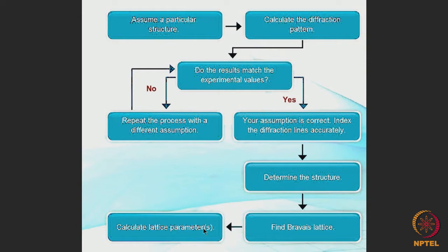If on the other hand we find that the calculated diffraction pattern does not match the experimental values, then we repeat the process with a different assumption.